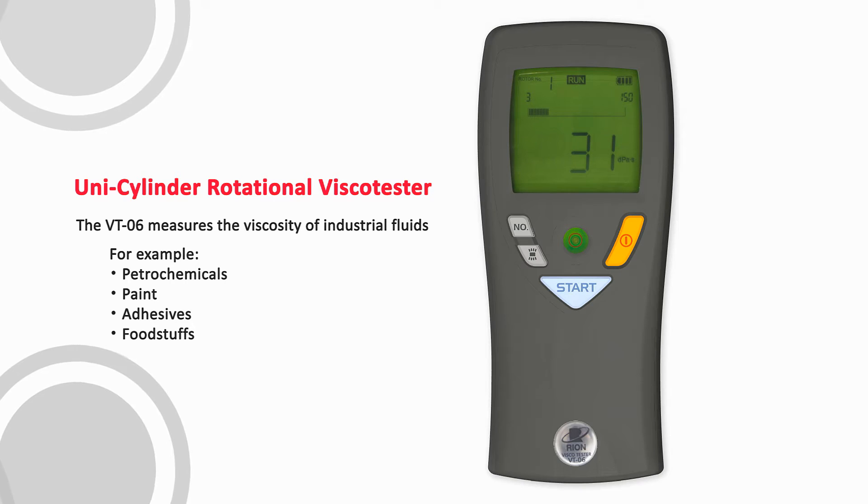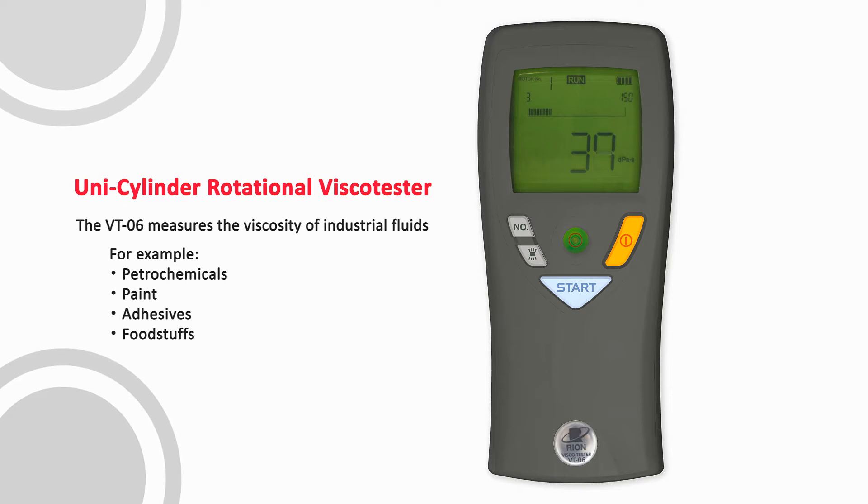The VT-06 measures the high viscosity of industrial fluids. For example, petrochemicals, paint, adhesives, and foodstuffs.